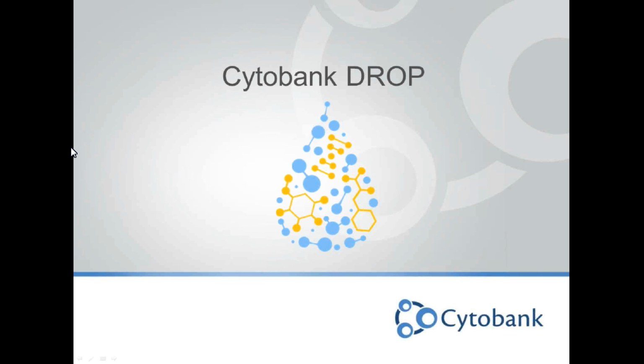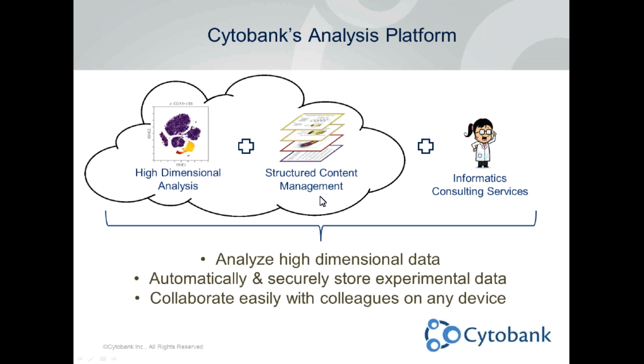So today we'll be talking about drop in Cytobank. If you're unfamiliar with drop, however, and Cytobank in general, I'll just take a second to walk you through it. There are three main components of Cytobank.